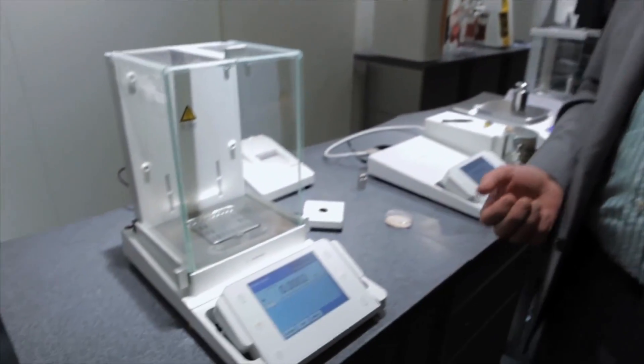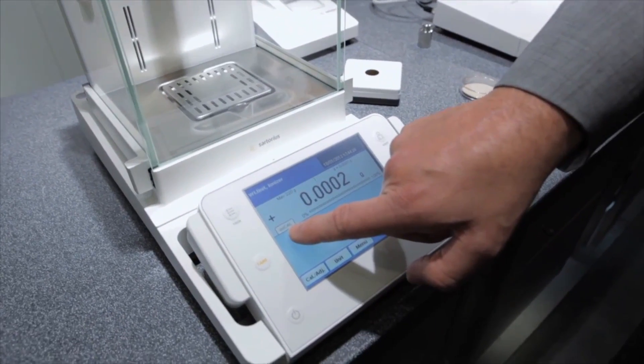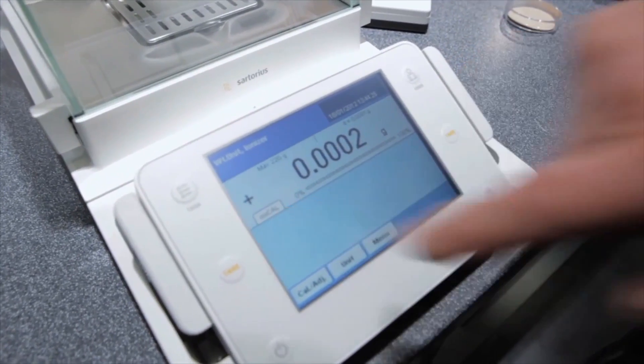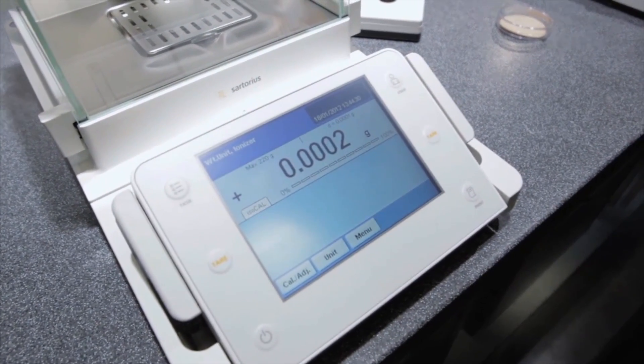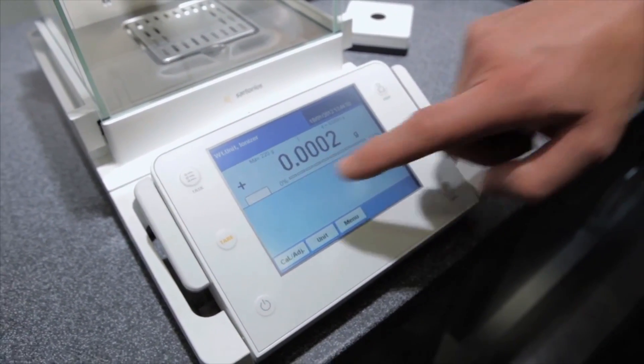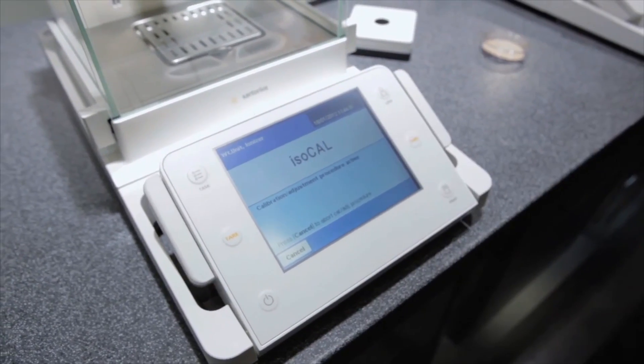Internal adjustment is happening at the balance as well. If the temperature changes we're able to see here isocal which is saying we should adjust the balance to bring the balance back into calibration. This will happen automatically or we can push the key ensuring that the internal adjustment is happening.